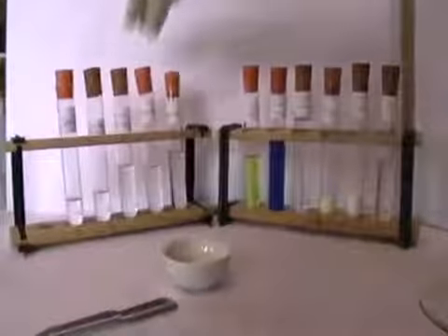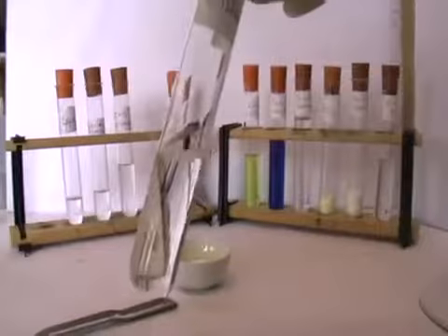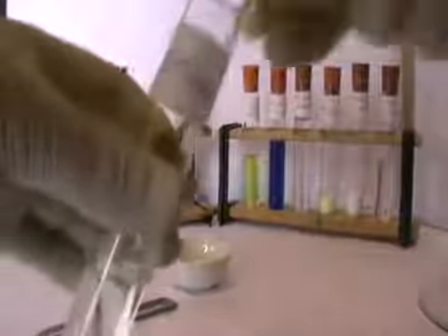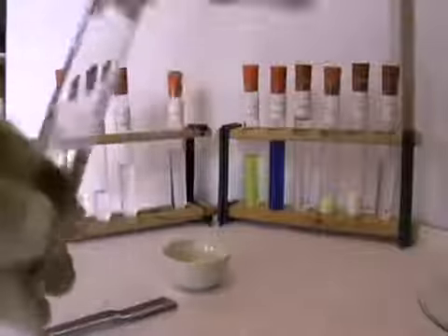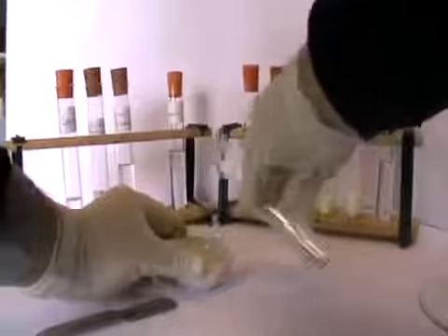Next, let's take a look at ethanal, the aldehyde. This here is ethanal. It's a colourless clear liquid again, and its smell is described as having a sour apple smell or a rotting fruit smell. Pour a little bit of that into a fresh evaporating basin. A little bit too much there. A few drops.